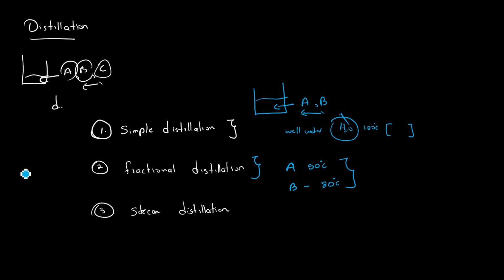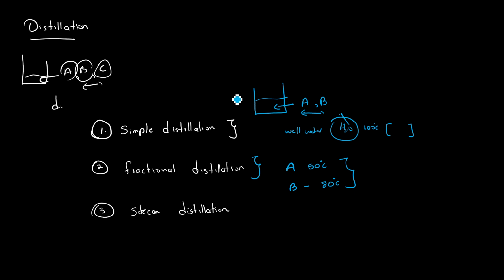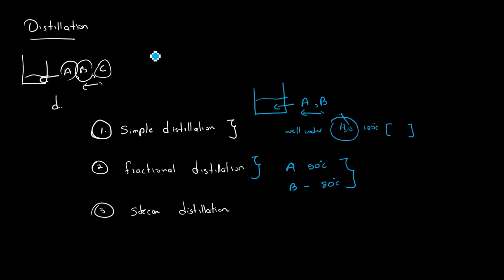So you know how we can obtain petrol, right? Let me quickly sketch it out. You can use this huge column, and each part contains a different temperature, like 100, 200, likewise. So each compound can be extracted from each part of the column. We will talk about this in a separate video, right? I just wanted to give you the simple idea.